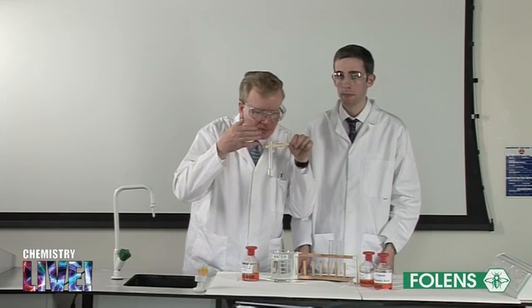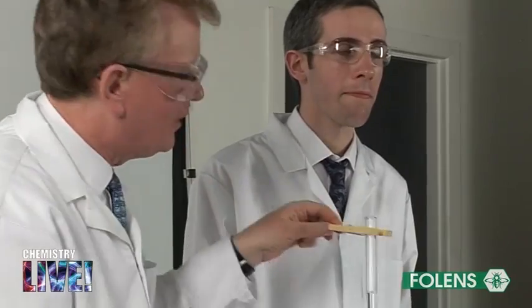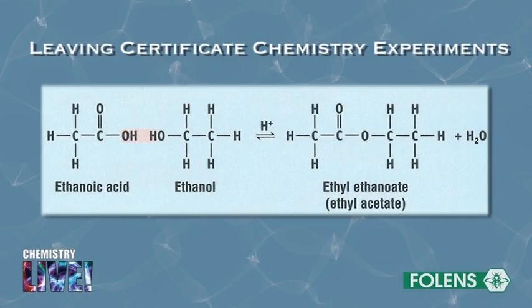Note that the contents of the test tube now have a fruity smell. The fruity smell is explained by the fact that the ester, ethyl ethanoate, is formed according to the reaction shown on the screen.